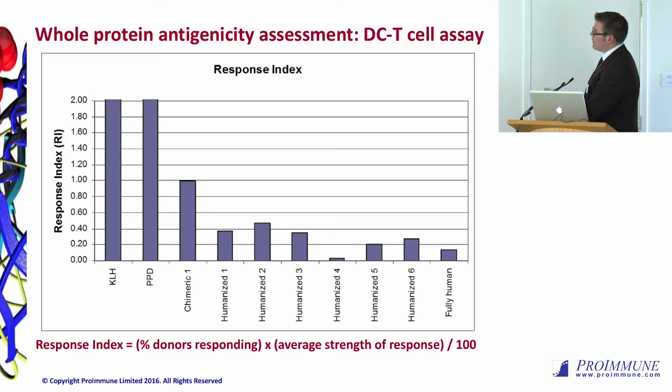So in this way, we have our controls, but it allows you to then comparatively measure the responses of your different antibody therapeutics. That's typically what's being used, but novel scaffold proteins, things like that. These aren't absolute numbers, these response indices, but they are qualitative, I would say, because ultimately if you use a different 40 donor, 50 donor panel, you will have a slight variation. And obviously you're limited by the number of cells that are available from a single donor. But ultimately we see that the same pattern emerges from how you analyze these different proteins.